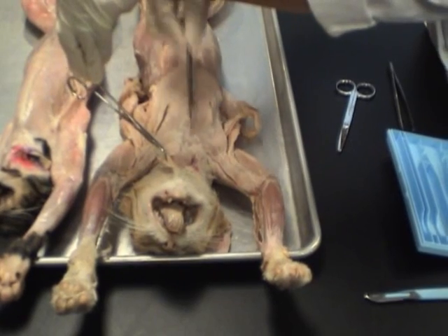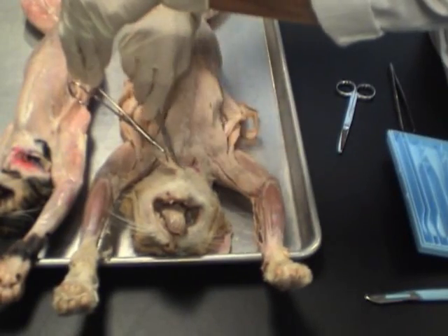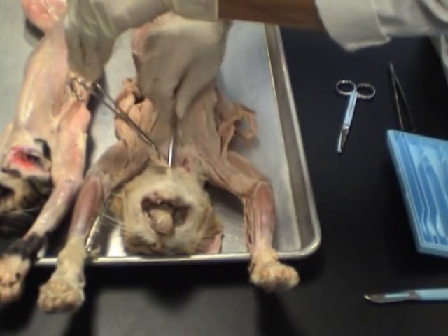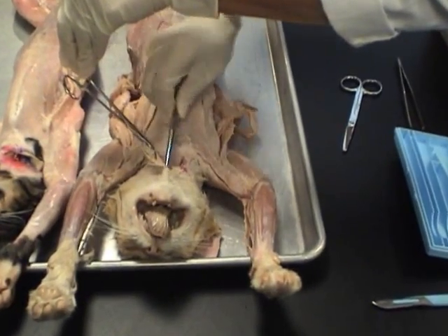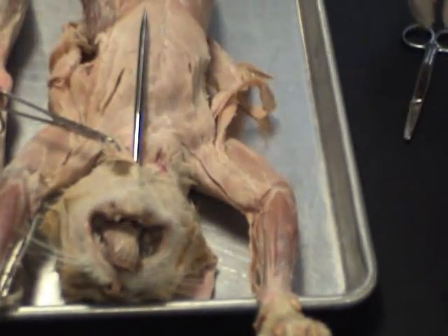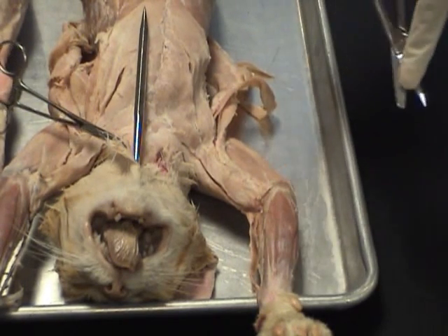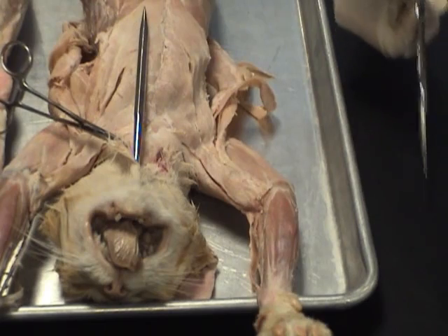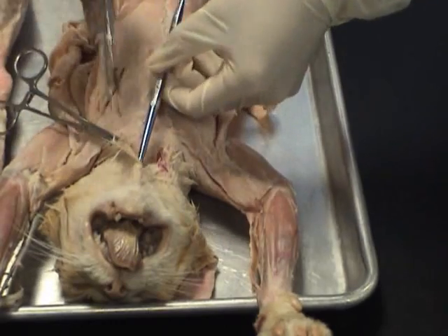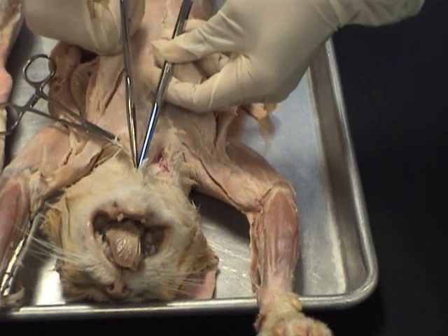So you see what I'm doing? I'm inserting the blunt, rounded end of the probe, and I'm wiggling it a little bit to loosen the pelt. As you do this, see how it's getting further and further. At this point, I will take the scissors, and remember, always cut with the blunt side down. I'm going to cut along the probe. So for example, with the blunt side down, go alongside the probe, and I'm going to cut the pelt.